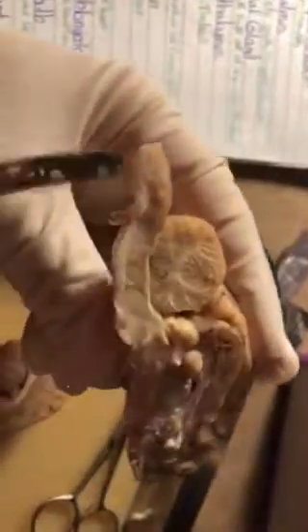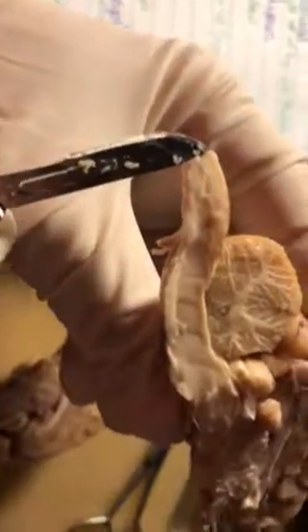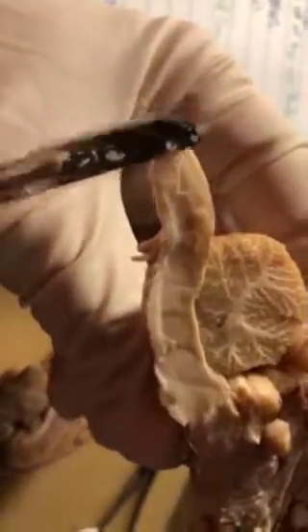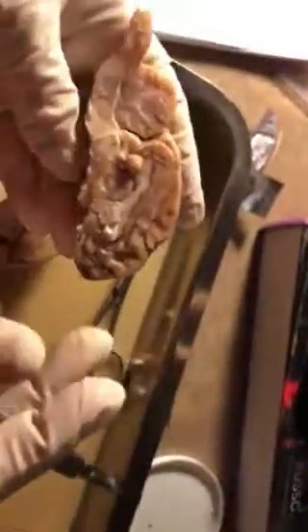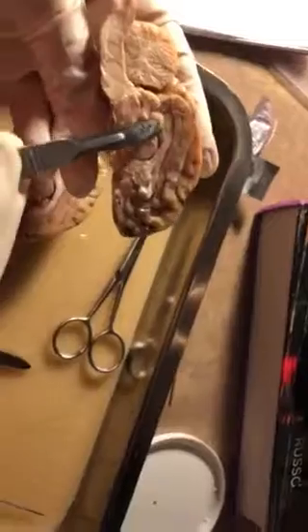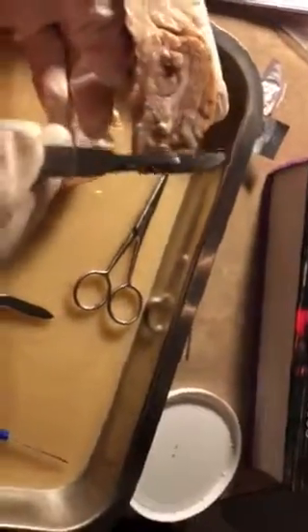Well, I can add that this part right down here is the spinal cord, which sticks straight out for a sheep, which differs from a human brain, because a human brain would be angled towards the feet instead of out towards the back or a tail. So that is all the parts of my brain, and that is going to conclude my video on my brain.